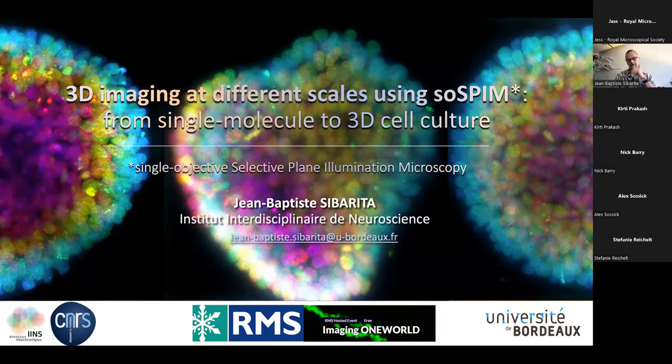But now we have switched for many years, thanks to a collaboration with the group of Virgil Viasnov in Singapore, to work on 3D cell culture. The reason why we moved in this direction is, as I will show you, really technology driven, with a common technology that we developed more than 5 years ago, which is called SOSPIM, the single objective light sheet microscope.